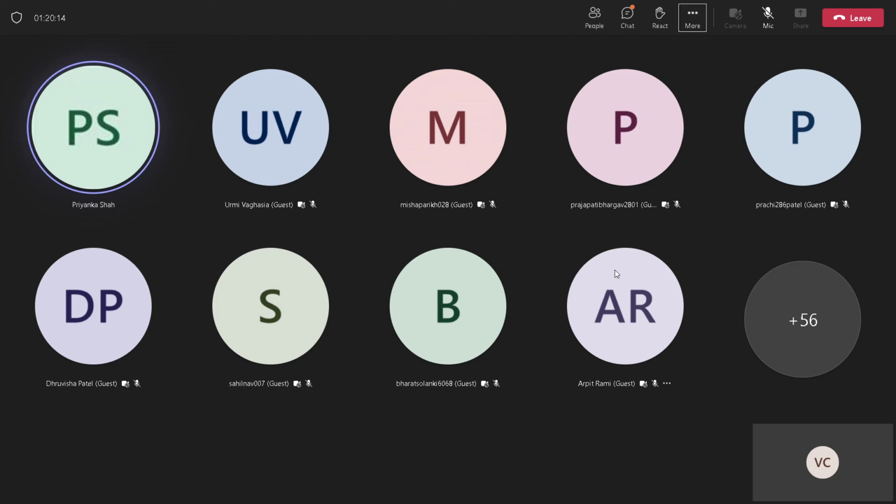Then another question could be: by which action will your solute migrate upward on the TLC plate? Capillary action, not gravitational action. Capillary action. Okay. And then, which kind of adsorbents can you use? All those names you had, like Kieselguhr, zeolite, silica, right? You need to remember all those names.